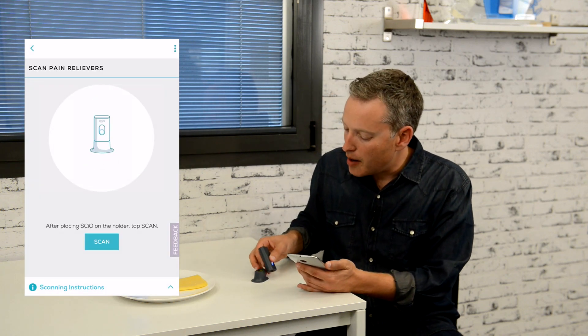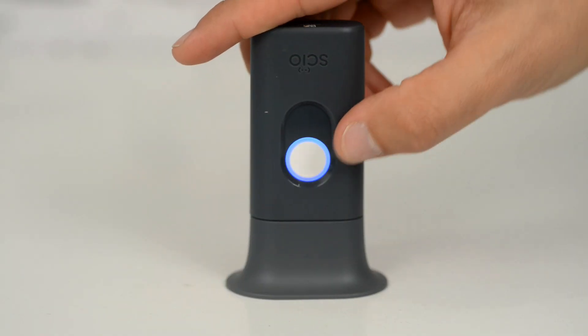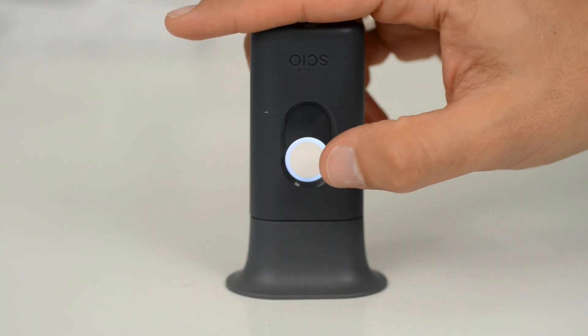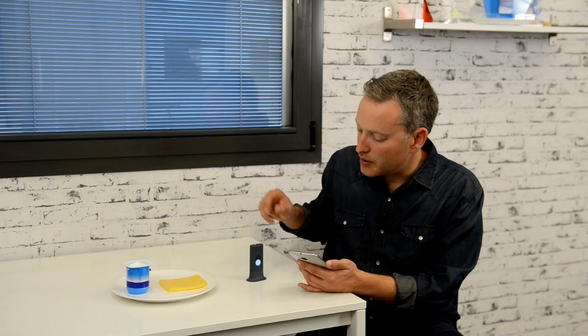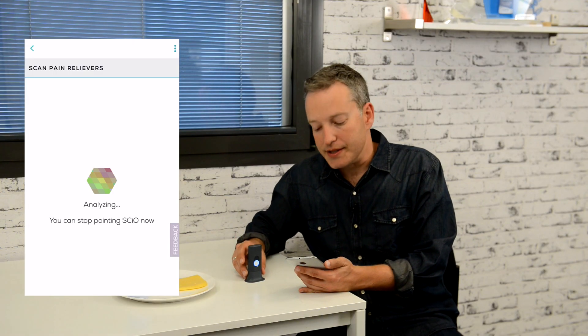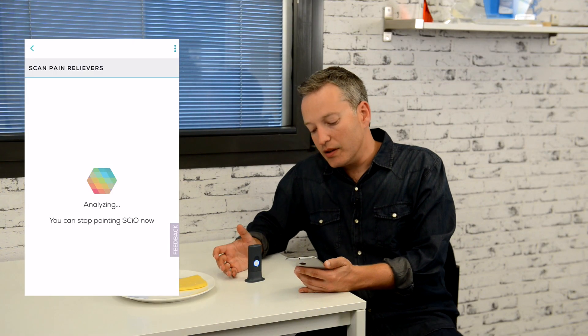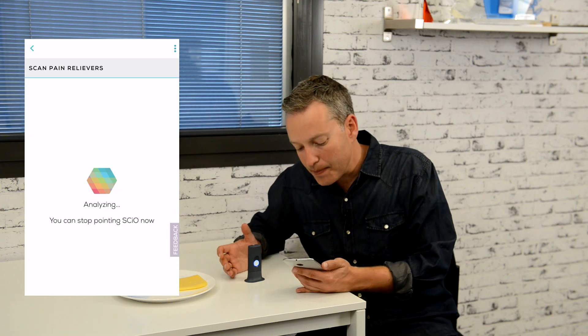Placing the SCiO on top of the holder with the cover or without it, tap scan, and you'll see that the magnets hold the SCiO in place. For this pill, the active ingredient is ibuprofen.